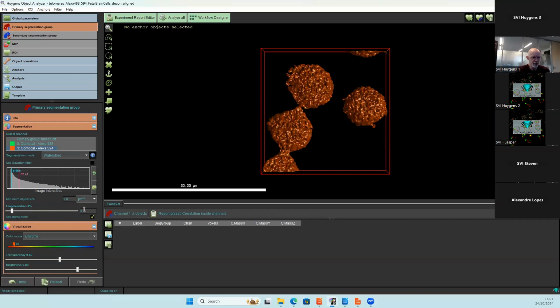You can also type that in on the left, right of the slider. Then the color mode, we need to set to high contrast in order to see what are now considered as different objects. And also under the scene, you see now that we have 5 objects instead of 3, and the objects even get a different number here. So this is now number 1, number 2, and number 4.